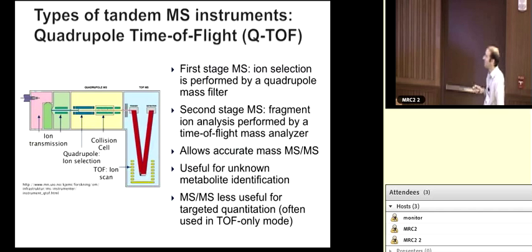Of course, this is among the most expensive types of mass spectrometers. Your throughput is limited just by the fact that no one can afford enough of these to do many analyses, and a lot of the time, more working parts means more likely to break down.